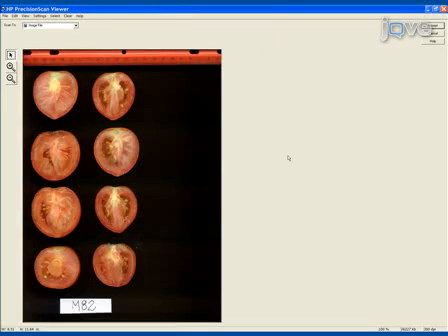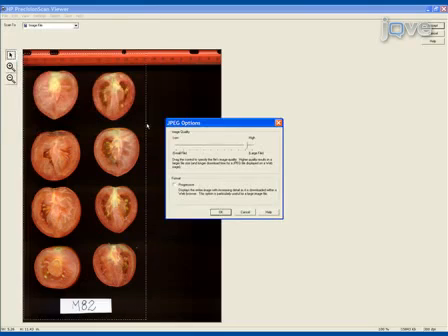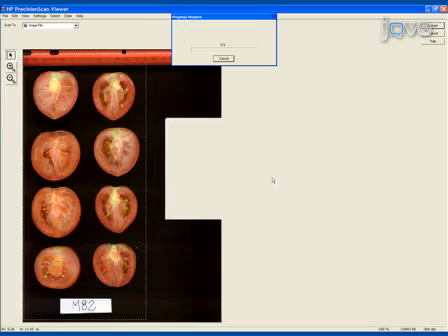After the initial scan, crop the image before saving it to avoid large empty spaces. If the image is not cropped at this stage, it must be cropped using imaging software such as Adobe Photoshop prior to analysis with TA. Save the scanned image as a JPEG file.